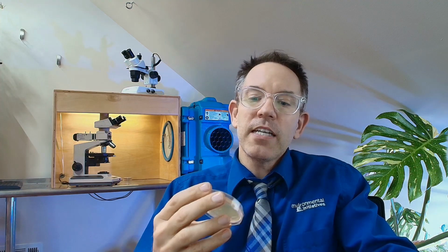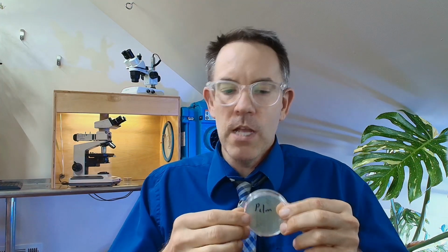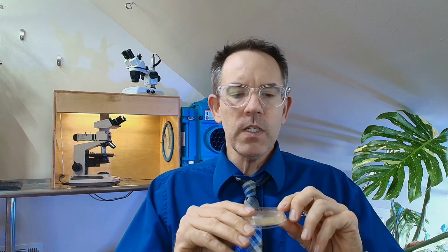Now, technically, you can analyze this yourself. The colonies will grow within 24 hours. Usually, I wait 2 days for the color to really form before I start to count. If you send them to us, we'll send you a lab report back. If you do them internally, you can use them to test your own work to see how good your crew is doing, or if you want to know if something was sewage at the start of a project. You can, by the way, take swab samples and send them to us, and we'll do the same thing.